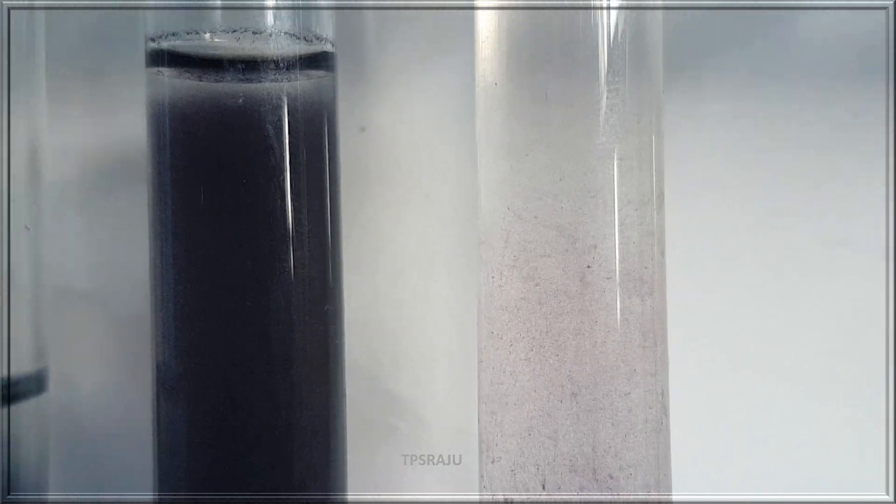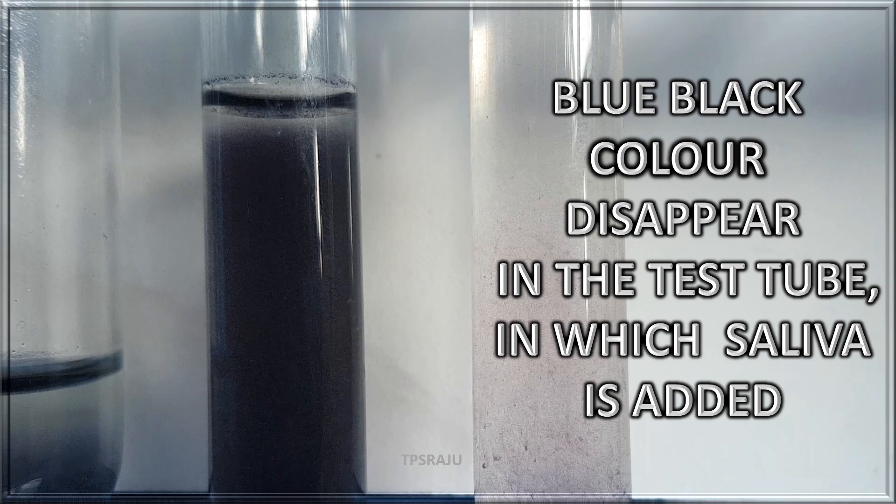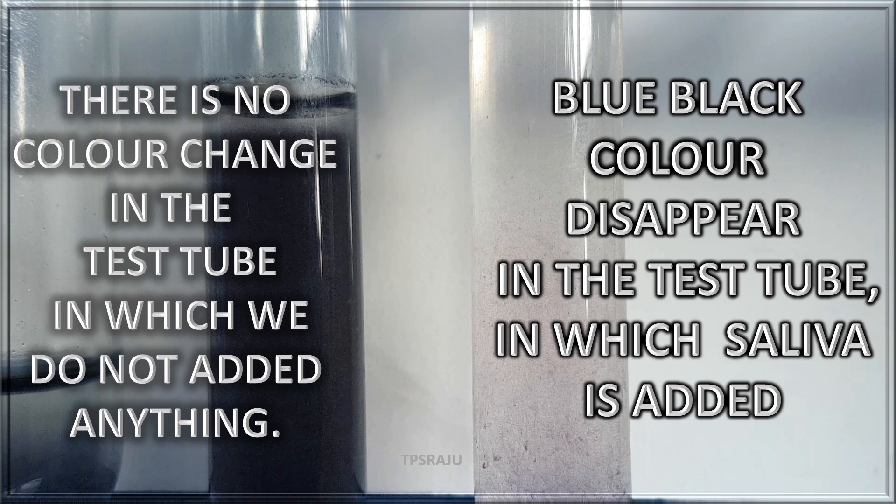What happens here? The blue-black color disappears in the test tube to which saliva was added. There is no color change in the test tube to which we did not add anything.